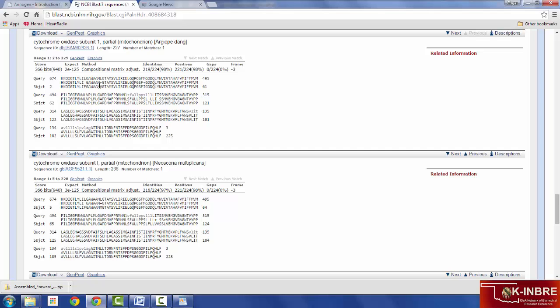extracted. And so if we assume that the sequence that we submitted is supposed to be exactly like the sequence from this organism, then how do we interpret these differences between our sequences? So in order for one amino acid to change to another amino acid, there must have been a mutation at the DNA sequence level. How do we interpret that?